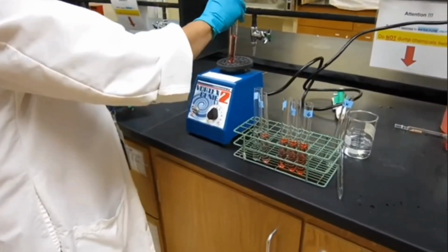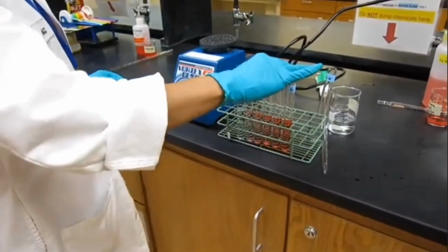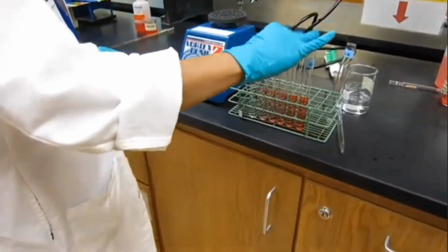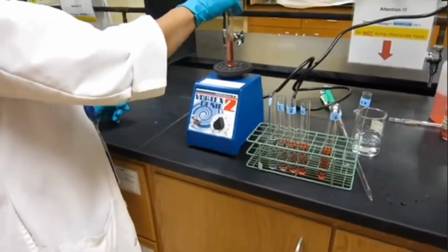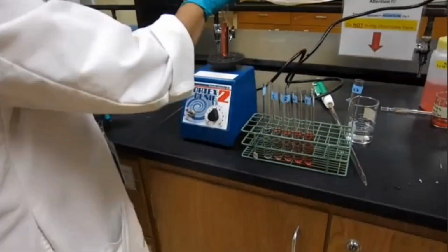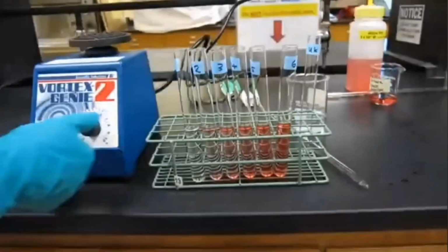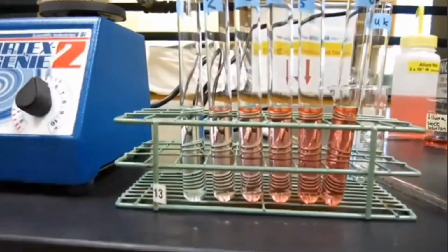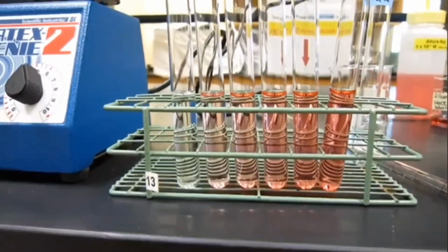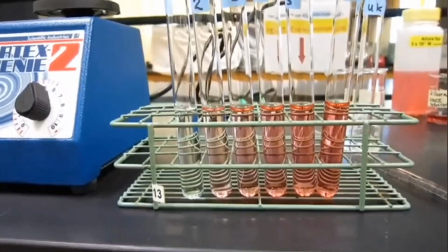So getting it stirred to have a homogeneous solution. If you don't have this equipment to stir, you can also use a glass rod. Do you see that? We can see that the intensity of the color is increasing.